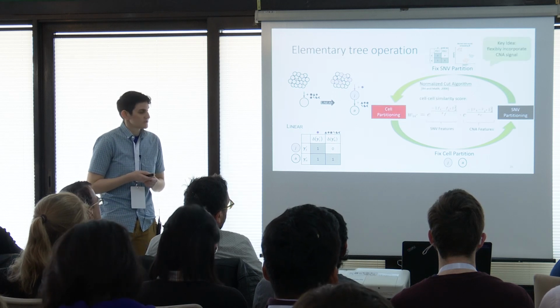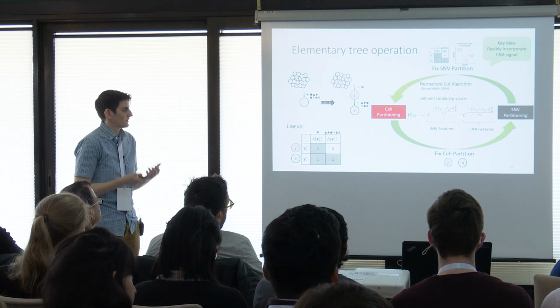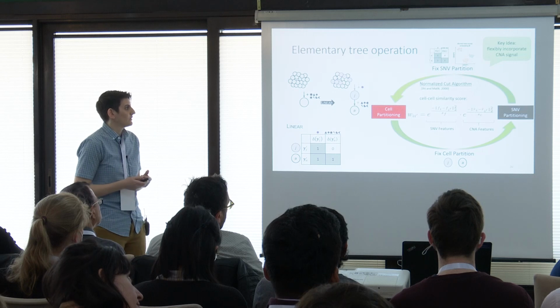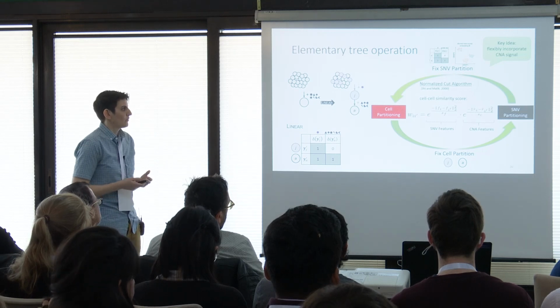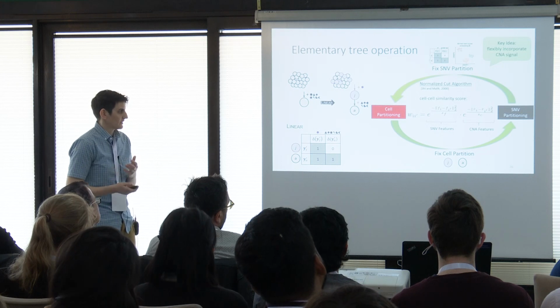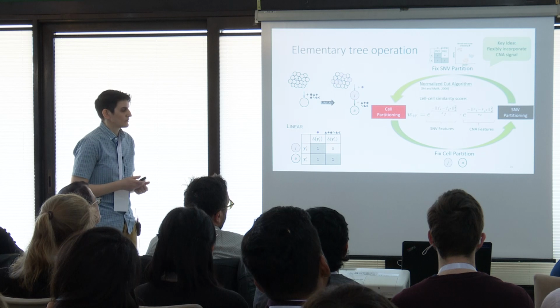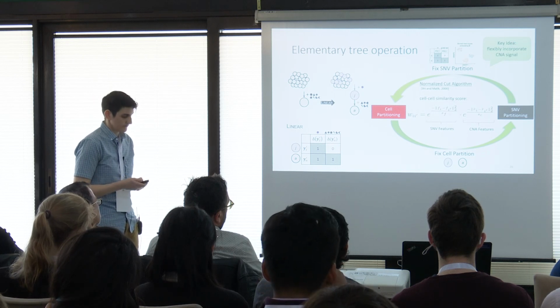Starting with a cell partition, this is where we're going to bring in the original key idea. We're incorporating the CNA signal via this read count embedding. To do the cell partitioning, we use the normalized cut algorithm, which requires a cell-to-cell similarity score. We derive this using mixing information from the SNV and CNA features in order to balance the trade-off between these two signals.